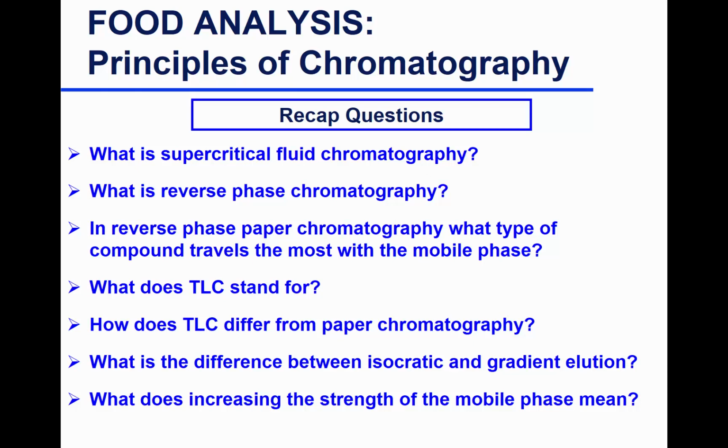What is supercritical fluid chromatography? You can read about it. Anybody want to volunteer? What's the mobile phase? Yes, for example, liquid CO2. How do we make CO2 liquid?